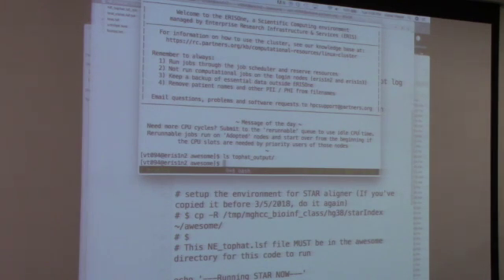If you wanna go back in home, just do CD, nothing. Just go CD. It's taking its time. Got a lot of things going on, okay. I think you went to the root directory or something. When did that happen? I was just screwing around. It should be CD space, or just CD. Either of those will take you home.